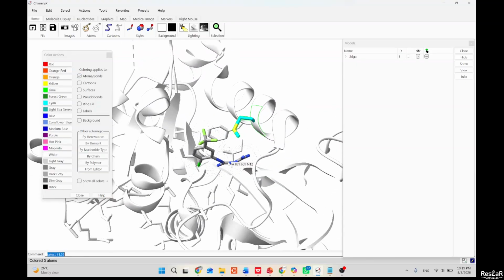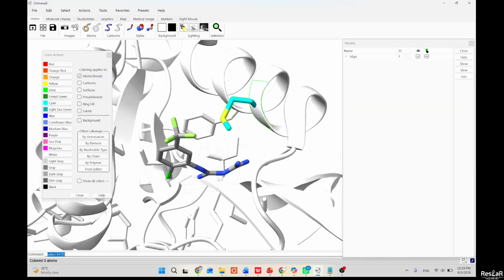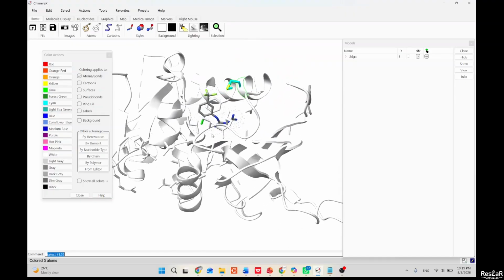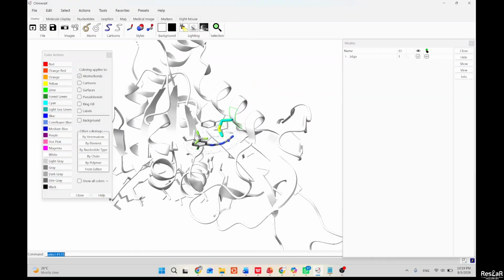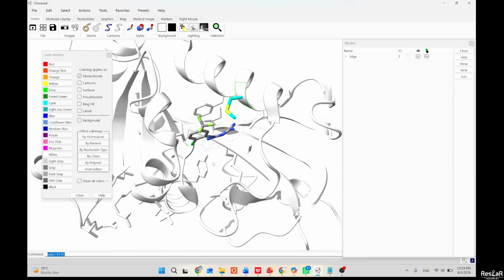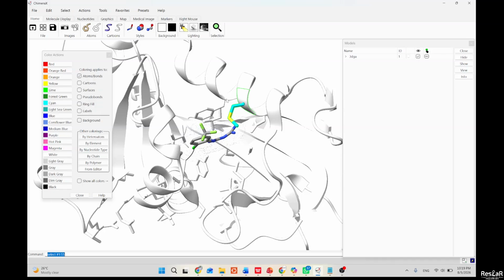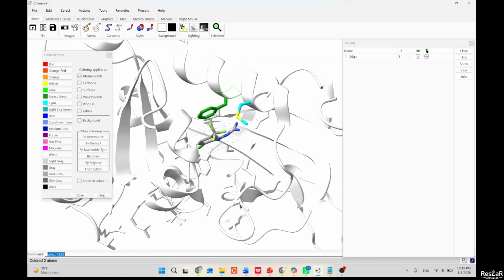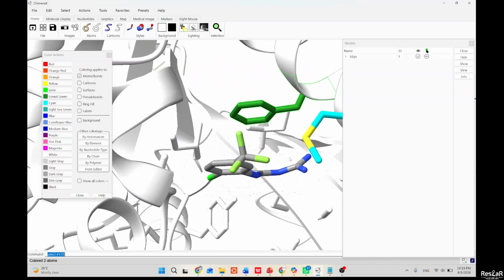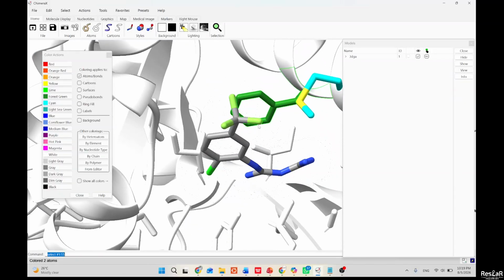So this is what you do to make it a bit fine. You can also choose any other residue of interest and keep coloring them until you get what you want. Maybe this forest green by heteroatom. It doesn't have a heteroatom because it's a phenylalanine. So this is exactly what you do in the active site to design it and make it beautiful or presentable.